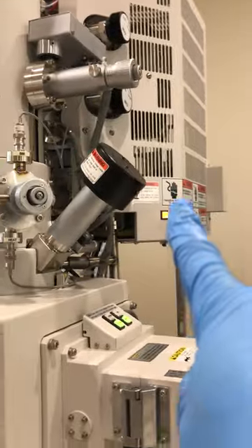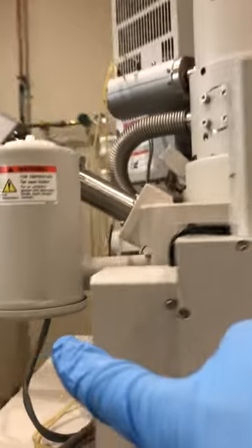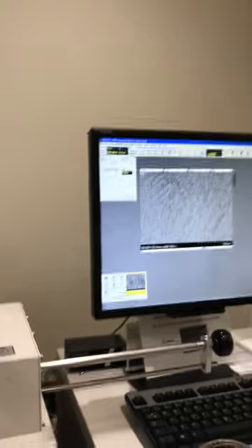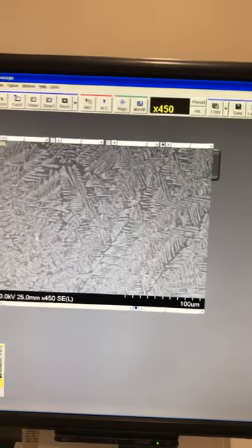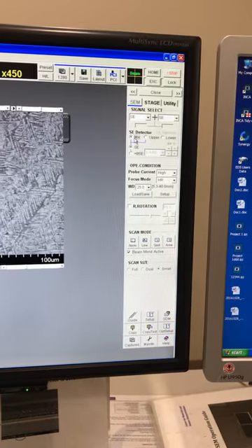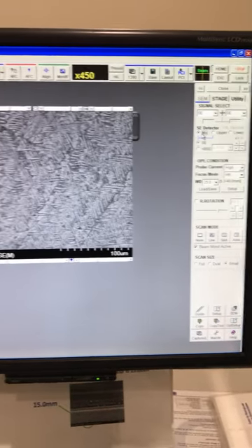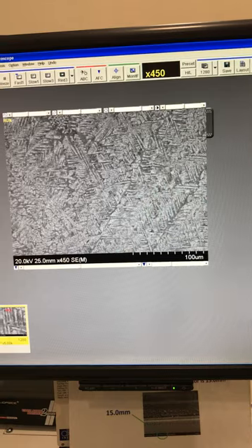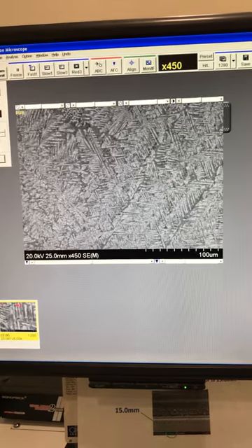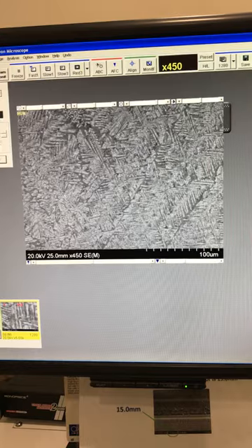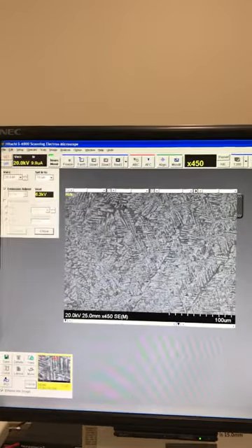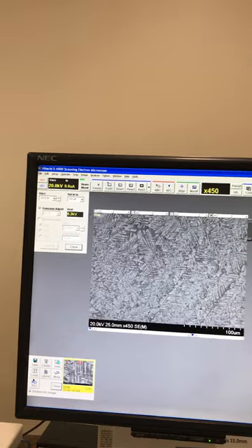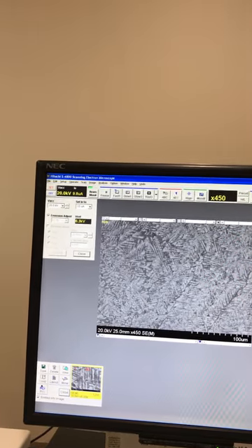As you already know, this is the upper one and the other one in the back is the lower detector. Check and see if both of them are in the right shape. Then try to mix them and take your image on the mixed setting because then you are sure that your image is the best image that you are able to get with this microscope.